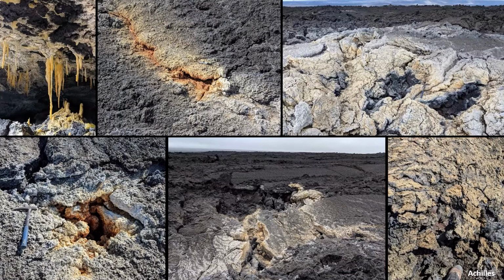In some cases, we think that the deposits are from water, like meteoric water, interacting with these materials and moving them around and redepositing them in other ways. So forming, in the striking case in the upper left there, these stalactite-like features of alteration products that have been moved by water. And so we analyzed a bunch of these types of features with the handheld LIBS and the handheld XRF.